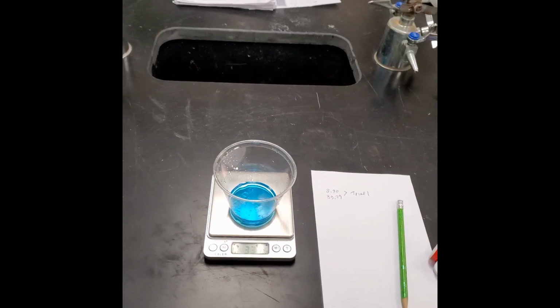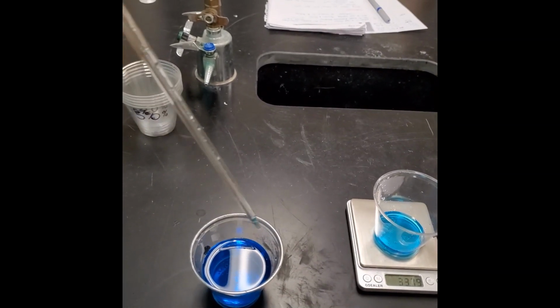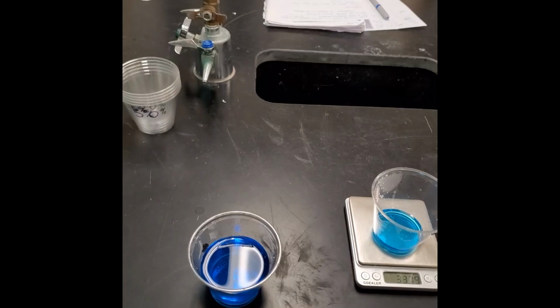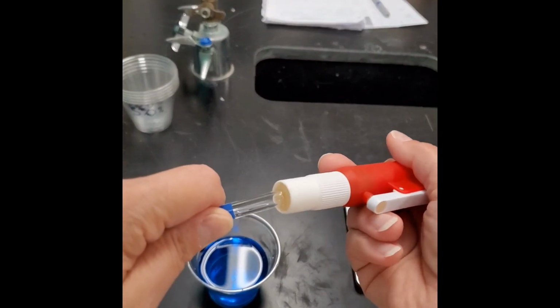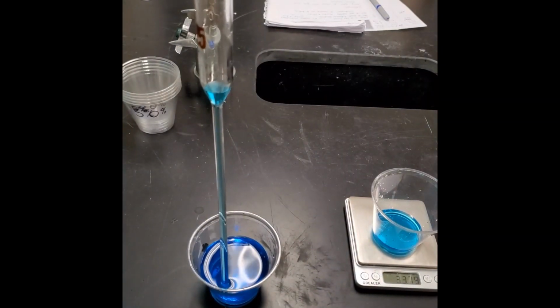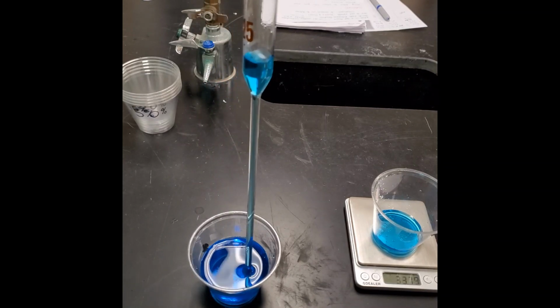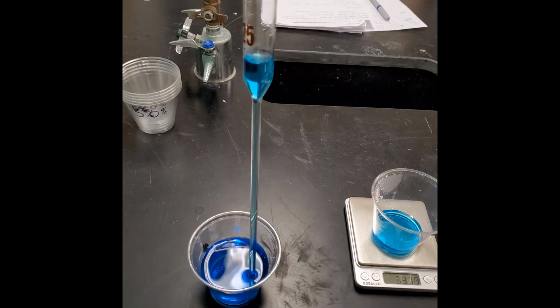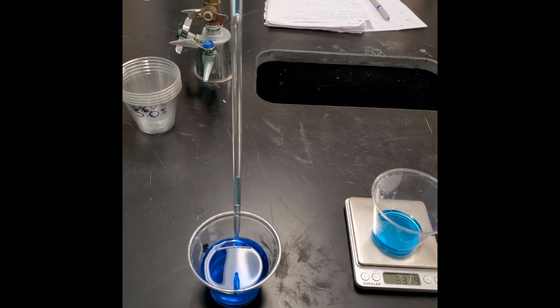So now I'm going to put this back into my sample. I'm going to put the filler back on, holding it up close to the top, and then I'm going to slowly dial up the plunger. Now, one thing to note: if as you're pulling the liquid up, let's say I pull it out of the water, oh, I get a big air bubble in there.